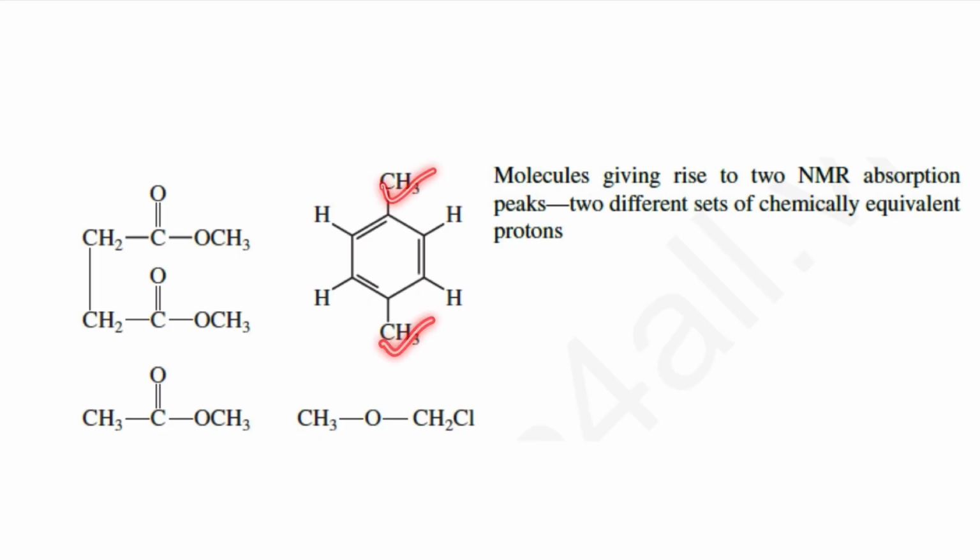Similarly, this methyl and these hydrogen atoms that are attached directly to the ring will be chemically non-equivalent. Similarly, these methoxy group protons and these methylene group protons are non-equivalent to each other. Similarly, this methyl and this methoxy group are both chemically non-equivalent.